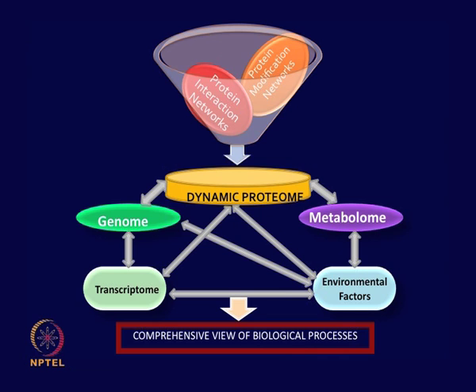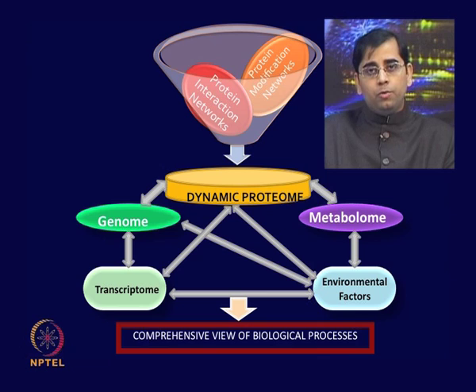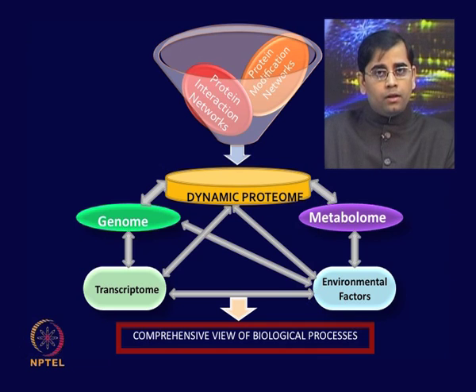So, as you know, the proteome is very dynamic and it represents very high complexity. Whether it is a study at the genome level, transcriptome level, proteome level, or metabolome level, all of these omic approaches require high throughput techniques and platforms.